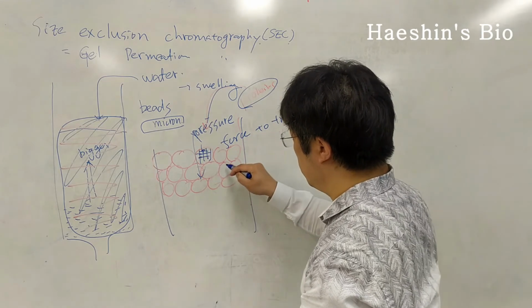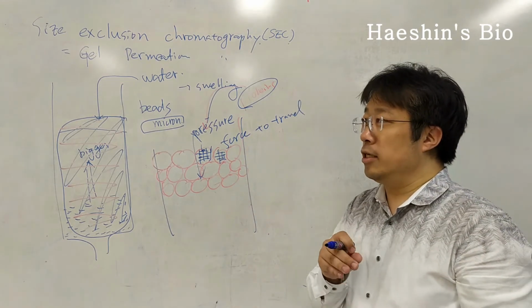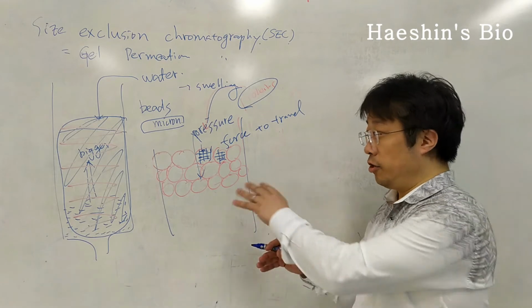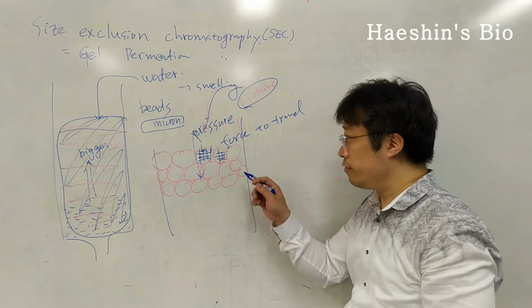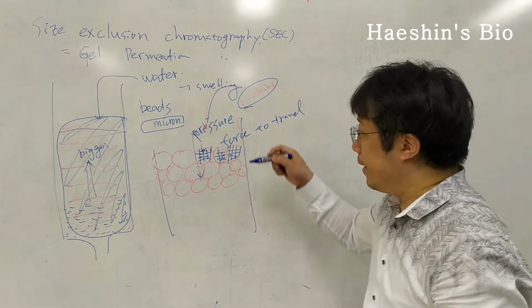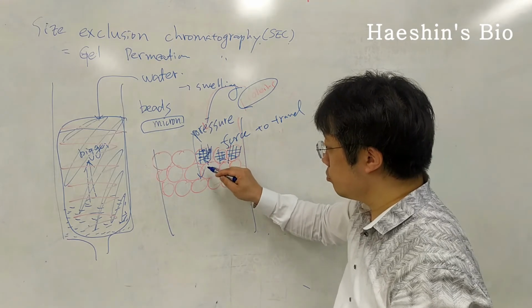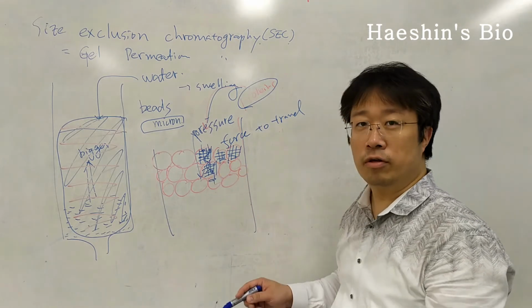So we can imagine these individual beads are like the second case of the previous class, which is the agar system. The polysaccharides in these beads are physically entangled with each other to make a network inside. So individual beads have a network in here, and then you can have proteins going inside and traveling through these beads, the networks of the polysaccharides, for a long time.